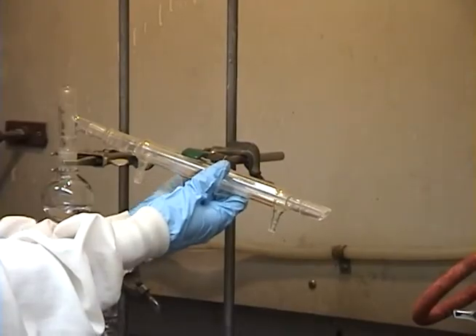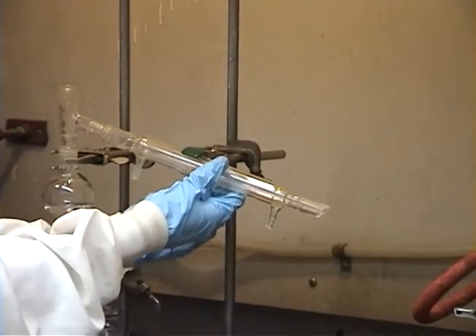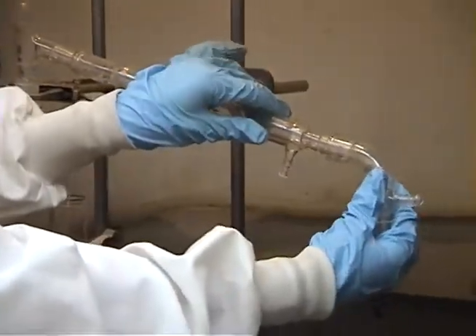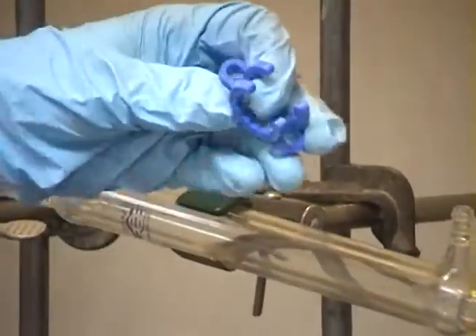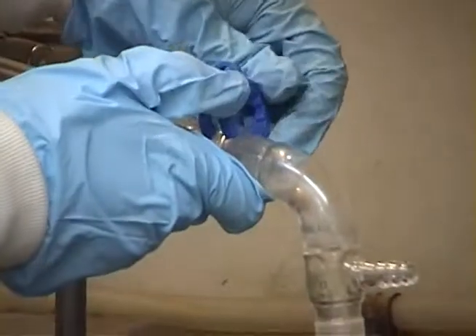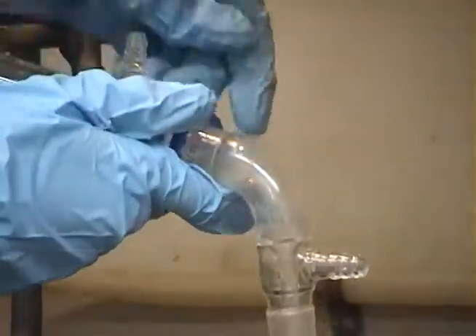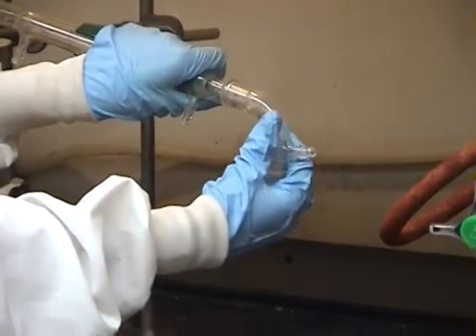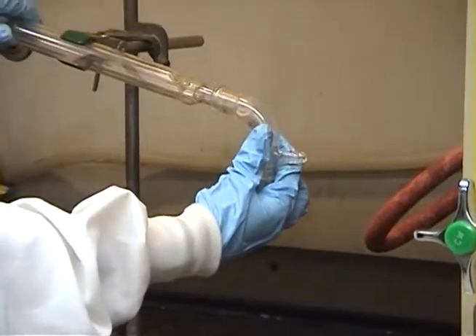On a separate ring stand, clamp the condenser sideways. A vacuum adapter is attached to the lower end of the condenser with a Keck clip. Ensure the openings of the condenser are pointing up.